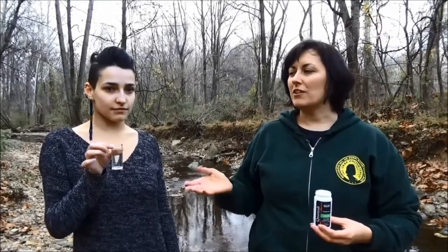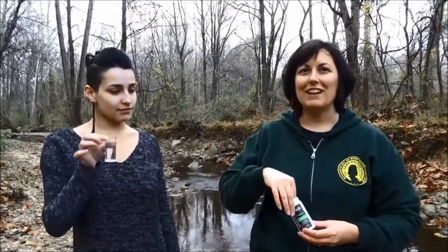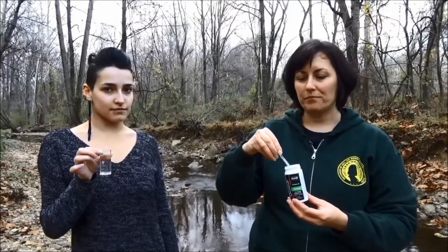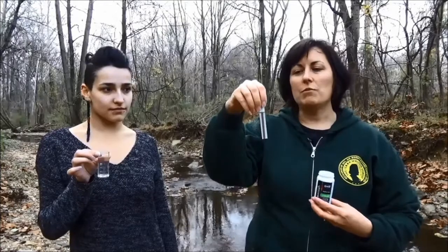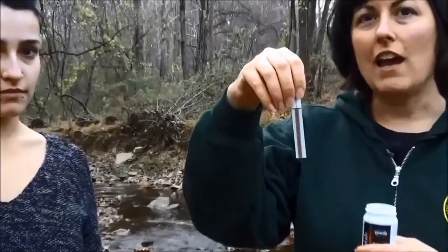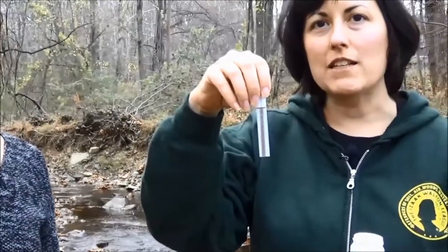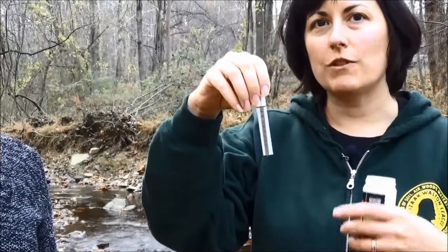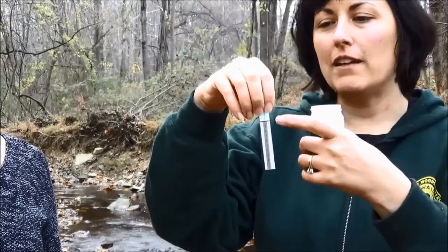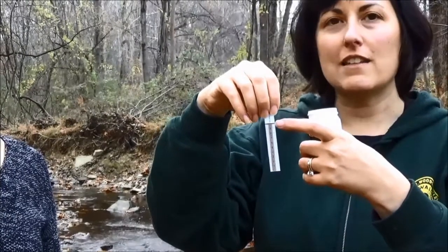We're going to measure chloride. We have our sample of stream water and this is our chloride test strip. What we're going to do is put this strip in the water and it's going to take a few minutes. We want to wait until the reaction has happened — you'll know it's finished when this yellow line at the top is completely covered with black.